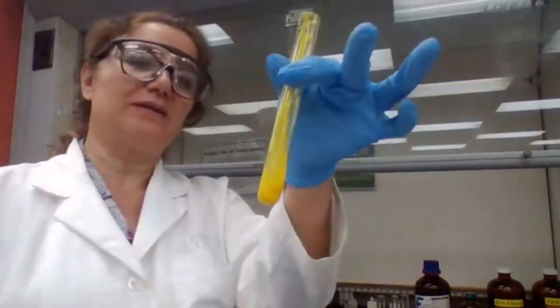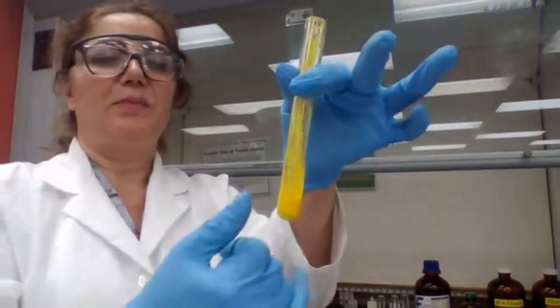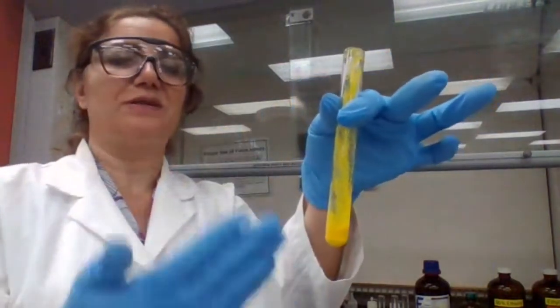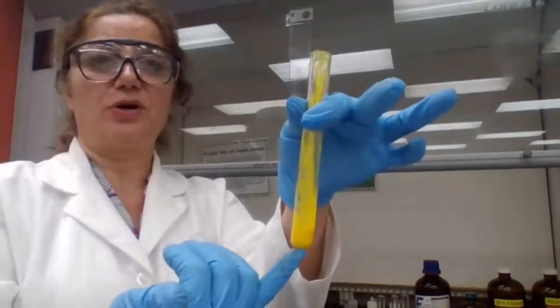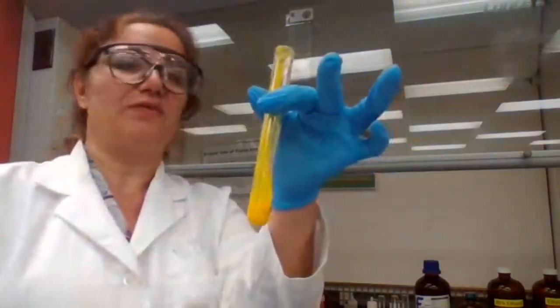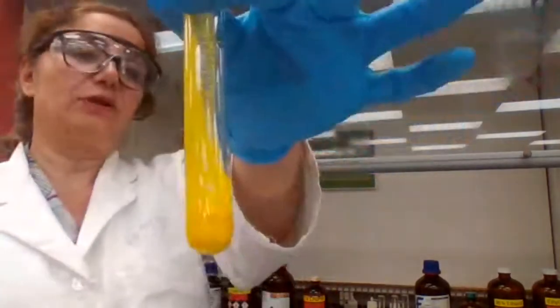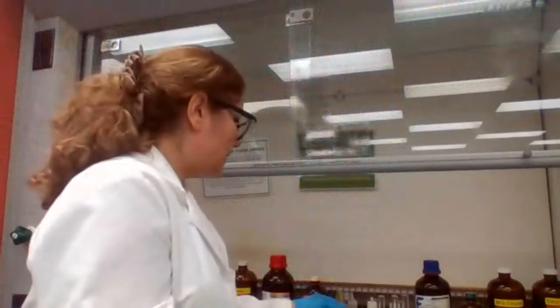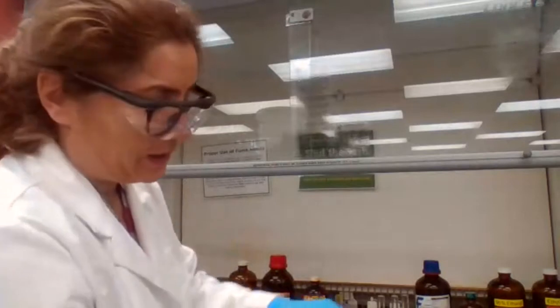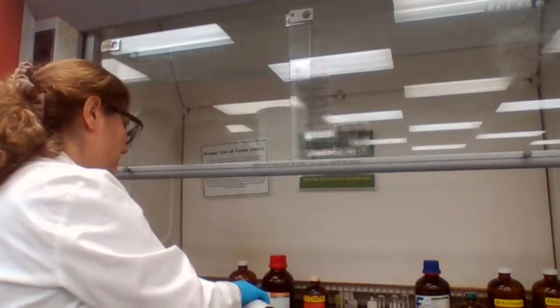If I don't discard this, like when I'm working with the unknown, this powder is already the precipitate of the 2,4-dinitrophenylhydrazine plus my ketone. So if I filter it and dry it, I can use this for my unknown, for derivatization by melting point. So it's very helpful to save it. Now, did you record the positive test for it? Well, they would all be positive, but we just want to make sure that you see they're not all the same shade of yellow or orange color. They could be different.